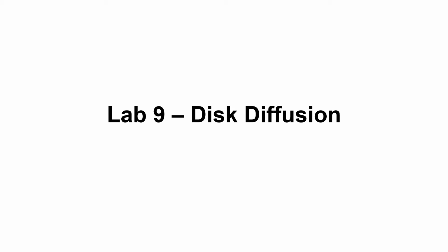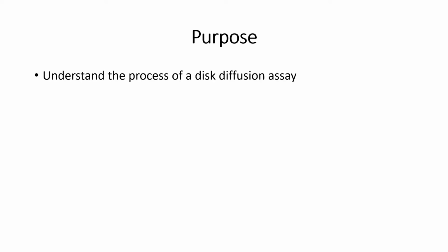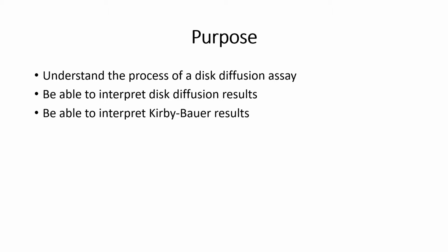This is the video for Lab 9, Disk Diffusion. The purpose of this lab is to understand the process of a disk diffusion assay, be able to interpret disk diffusion results, and to be able to interpret Kirby Bauer results.